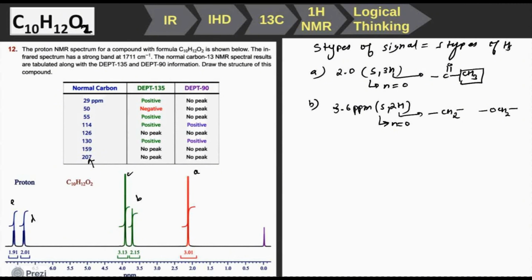But from the carbon NMR, we have seen that methoxy is present. So therefore, we can rule out the presence of this one. So what does it mean? Why is it going in the negative field? I mean, why is it going to the quite deshielded region?